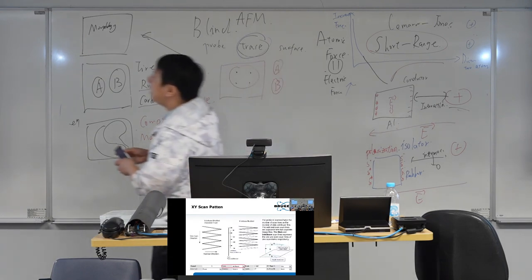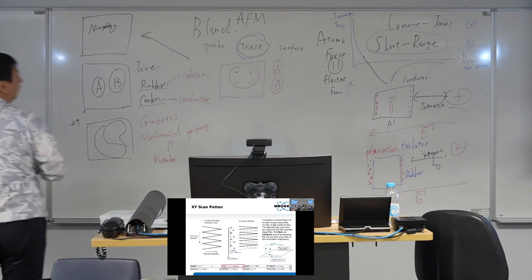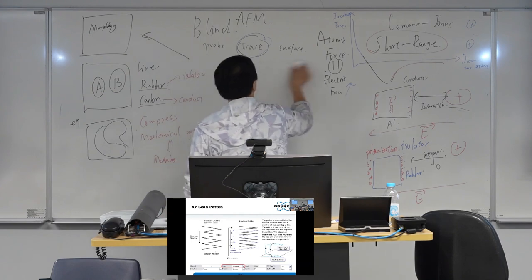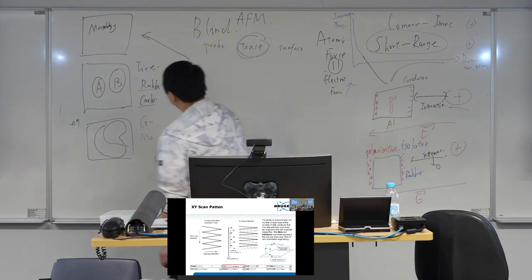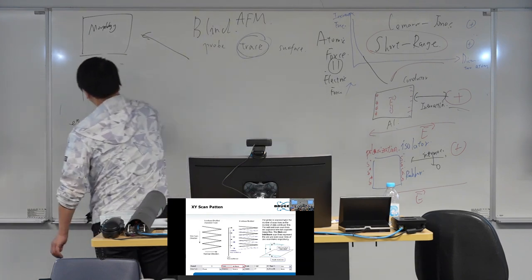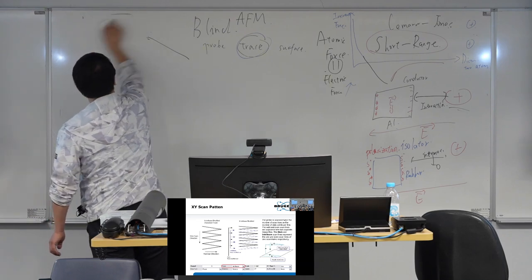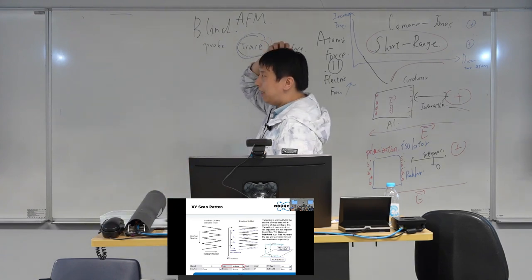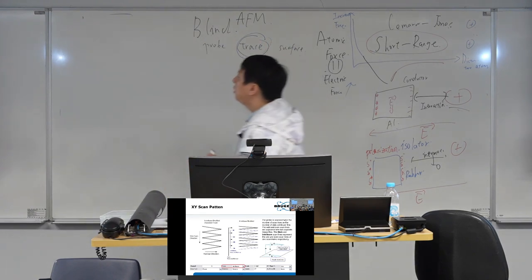The interleave scan, in the real way, it happens like that. So our AFM, we want to get the morphology.